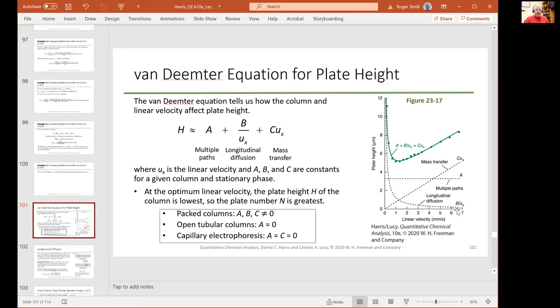If solvent velocity is high, what does that mean about the time for the separation? A small time? Right, exactly. So this is short time. And what if the velocity goes to zero? How long will your separation take? Forever. Yes, it will take forever. So this is like an asymptote here. This is like the Paleozoic separation, right? And this is like the one that blew by so fast, nothing really separated, right? Then right around in here, there's an optimum, okay?